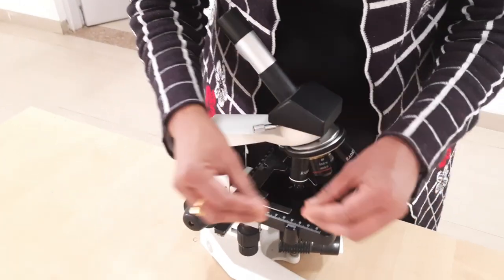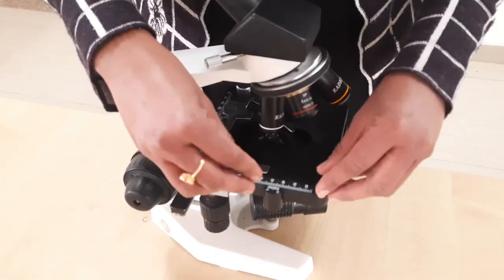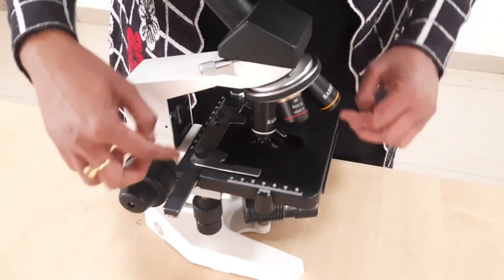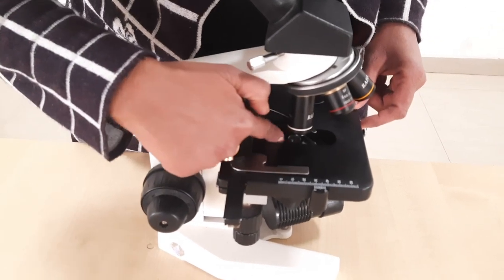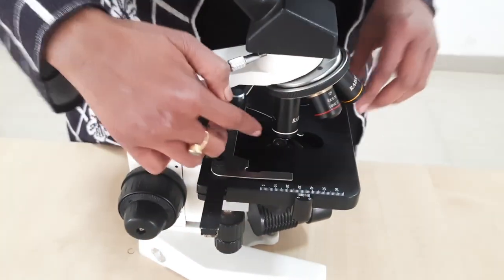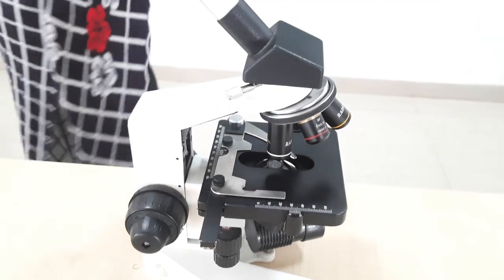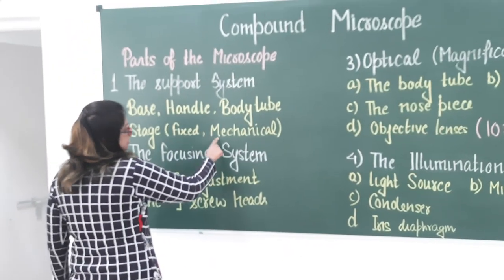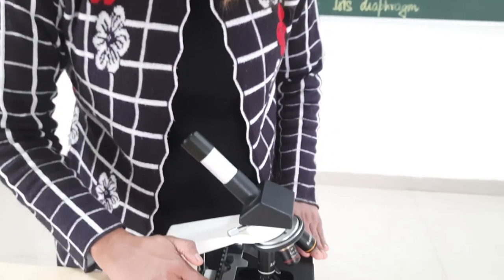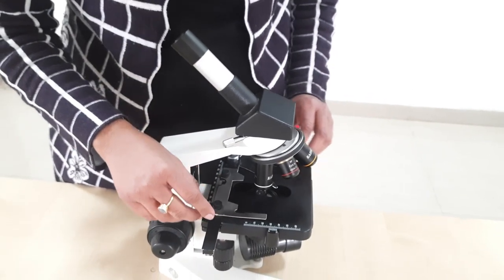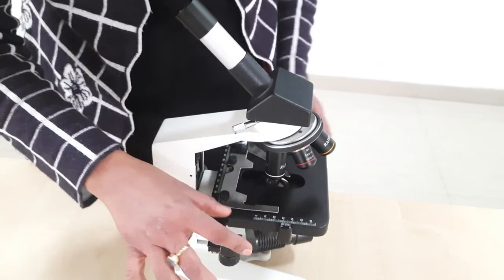The next part of the support system is the stage. In older microscopes there was a fixed quadrangular plate with an aperture in the center, and a separate mechanical stage. In this newer microscope, even the lower fixed stage is capable of moving.